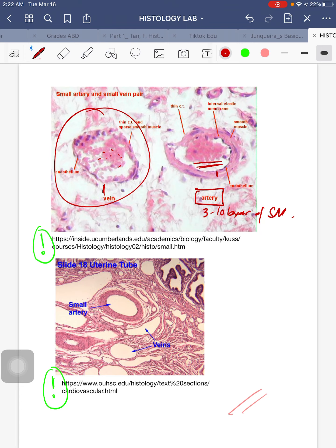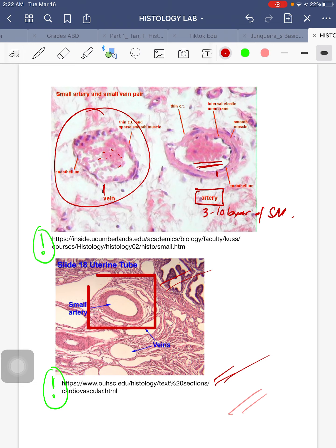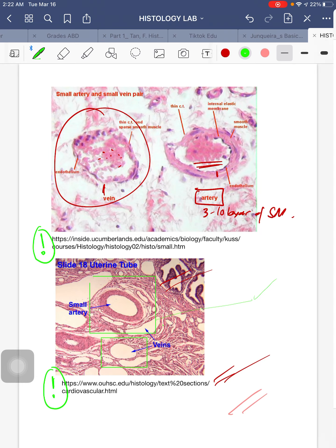For small veins, they have around 2 to 3 layers of smooth muscle; the tunica adventitia is somewhat unremarkable. The lower picture is actually better for your small artery. The vein picture is very characteristic — a very irregular slit-like shape with very few layers, fitting the criteria of 2 to 3 smooth muscle layers. That's all for this week. Thank you.